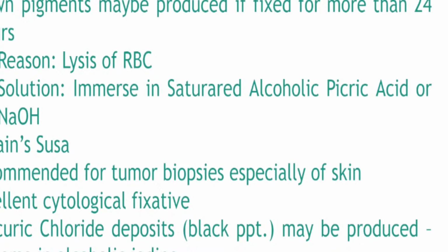Bakit, class? Yung mga nag-intern, bakit cytology na kagad siya? Kasi class, di ba? Ang liit ng sample, di ba? Minsan maliit lang na kuntil yung ibibigay sa inyo, di ba? Sino na mga nag-intern dito sa histopathology? Alam ko ang trabaho ng mga intern sa Pilipinas mag-receive ng sample, 'di ba? Lagyan ng label, 'di ba?